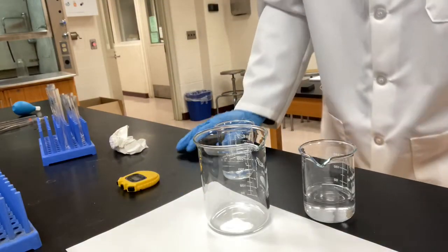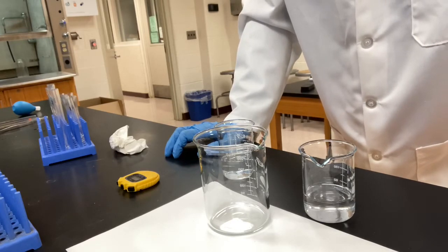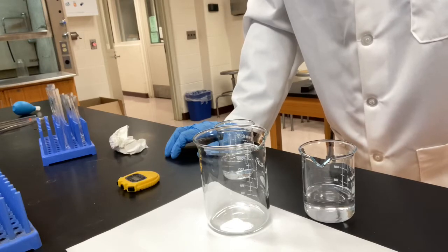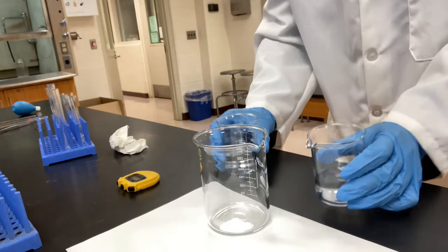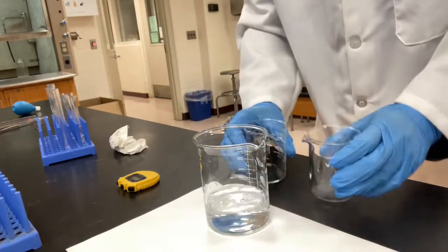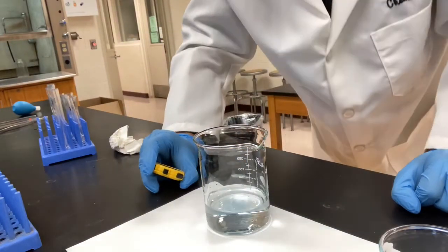Now let's move on to the third one. The third trial, the concentration of potassium iodate is tripled from the first one. So we expect the reaction rate is even faster. Hopefully it takes even shorter time before we see the blue color show up. Blue.